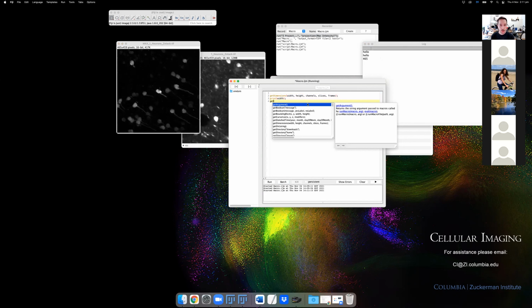And probably the last thing that really is important to go through is arrays. Arrays are a list of numbers or strings. And we use these a lot, especially for image processing. We'll create an array of files inside a folder. Just to give you an example, we can create a new array just by saying a equals new array. We could give it a size here, or we should be able to give it some variables. Let's see.